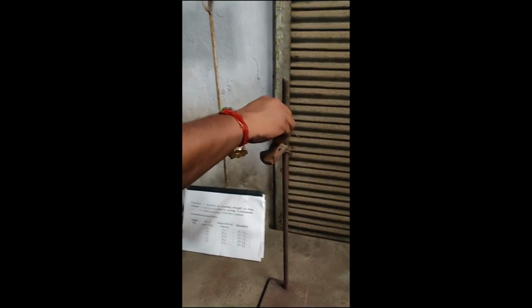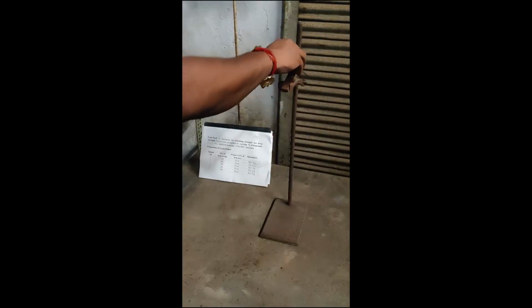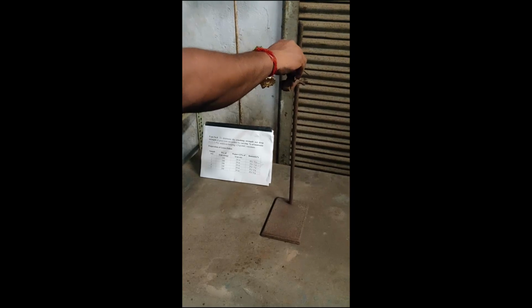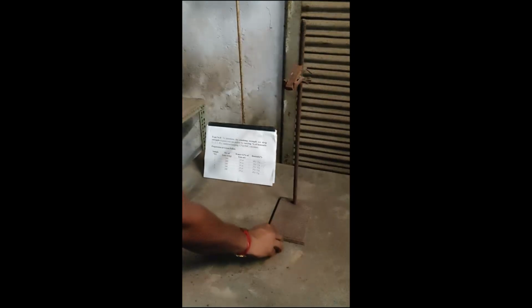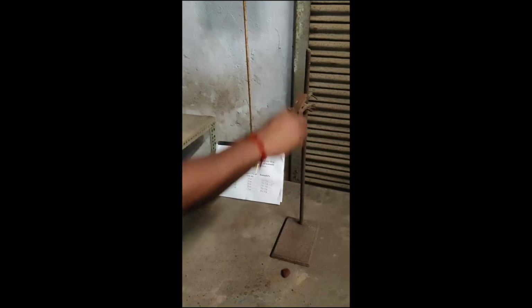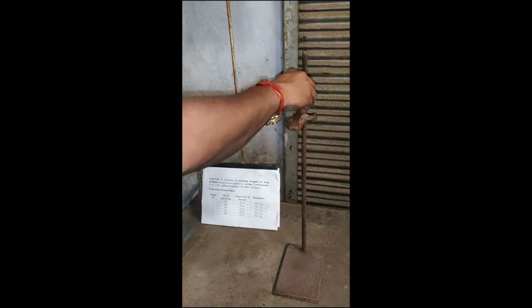So 3% bentonite green pellet. Again we're checking the drop strength. First drop. Second drop. Third drop. Fourth drop. Fifth drop. Okay, 3% bentonite. First drop.